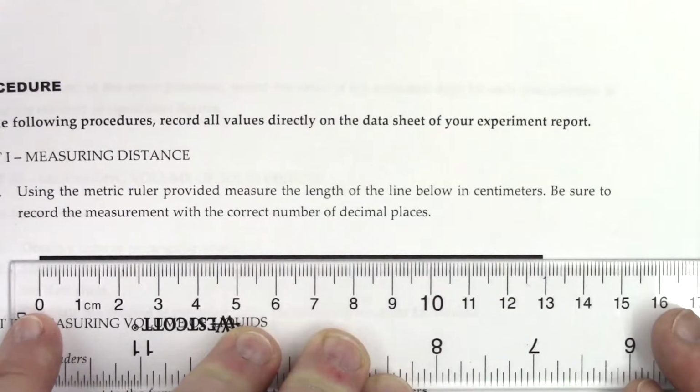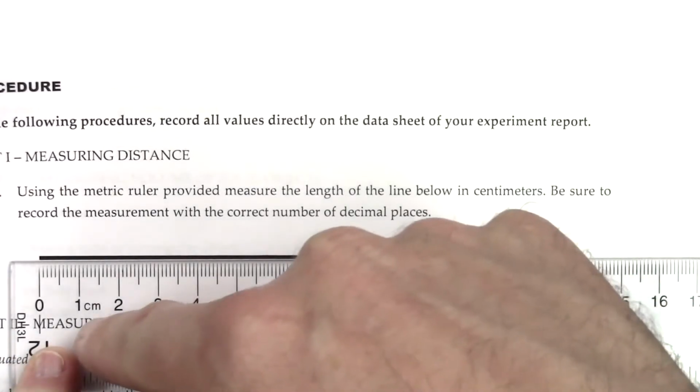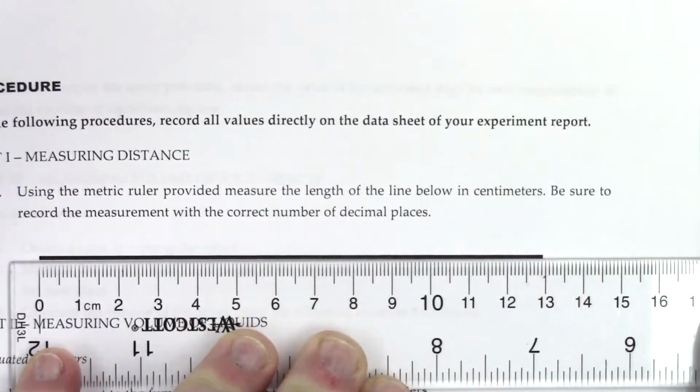Okay, class, here we go. This is part one of the scientific measurements experiments. Measuring distance, here we have our centimeter ruler. So here it is in centimeters right here. And here is the measurement.